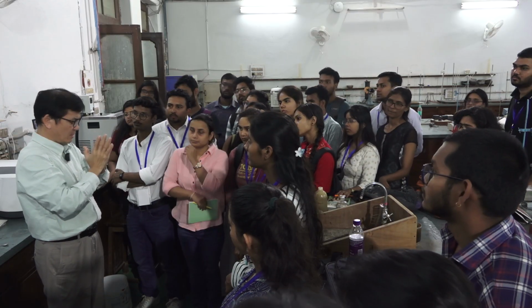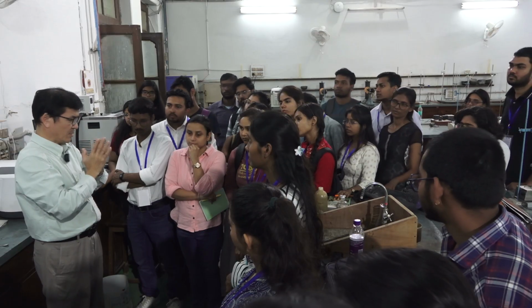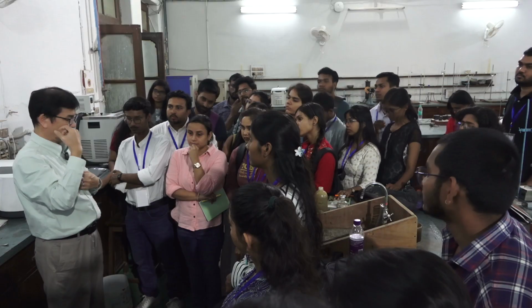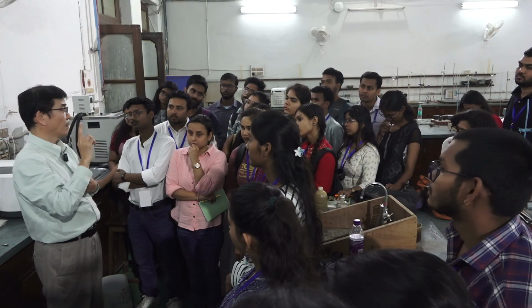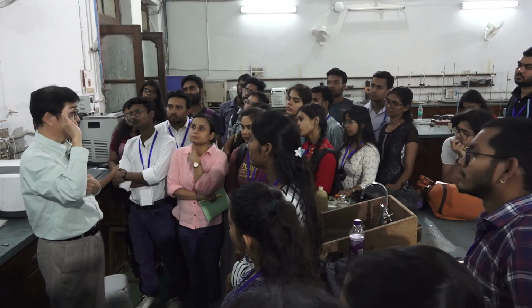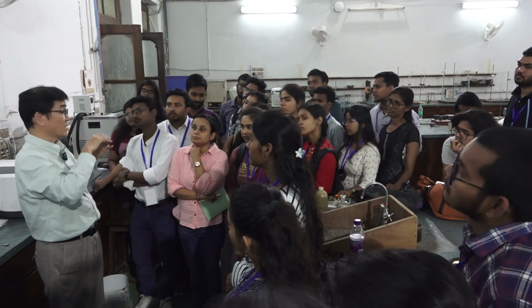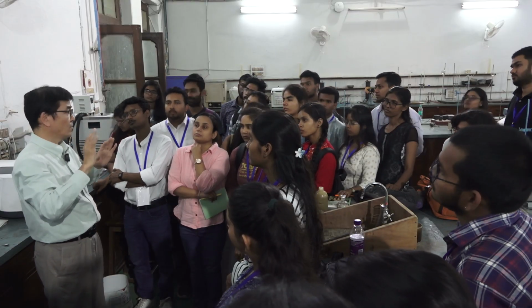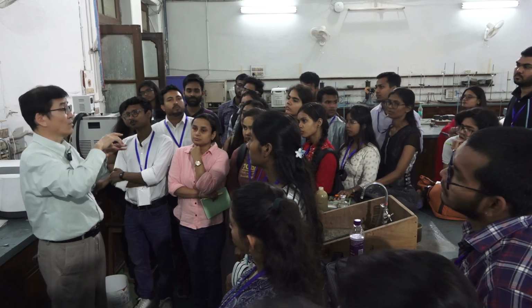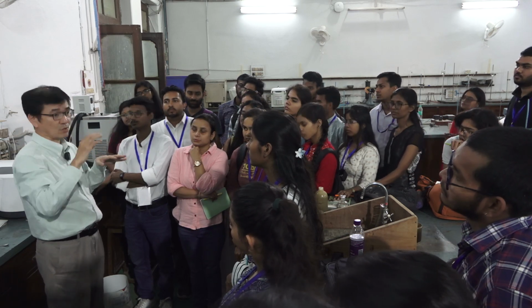This difficulty affects the measurement because we always need to measure two spectra: the solution spectrum and the solvent spectrum. In order to discuss the spectral pattern of the solute, we need to subtract the solvent peaks from the solution peaks.